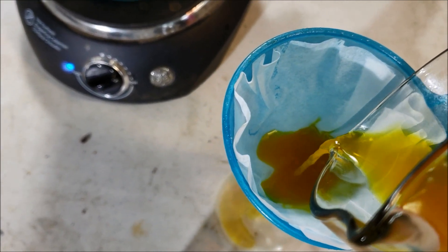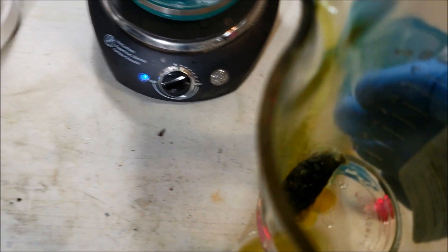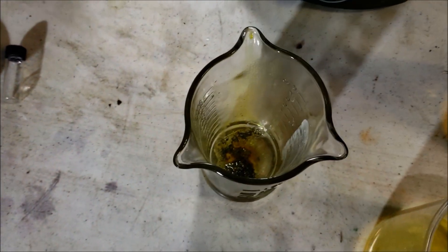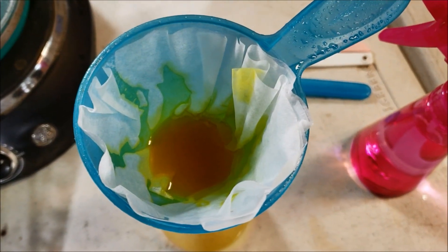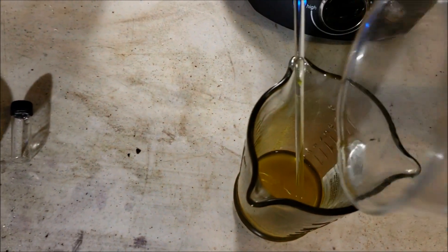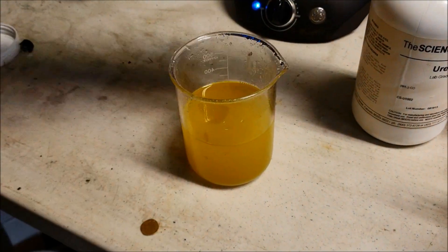Boy, you lose any of that yellow, that's all your gold. There's still a little bit of gold in there so I'm going to add that new batch, see if that helps move it along. We'll rinse that with distilled water, keep everything down there. Okay, look at that - there's my solution, that's my liquid gold.